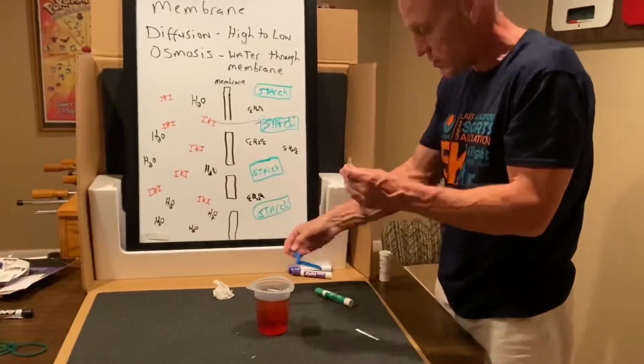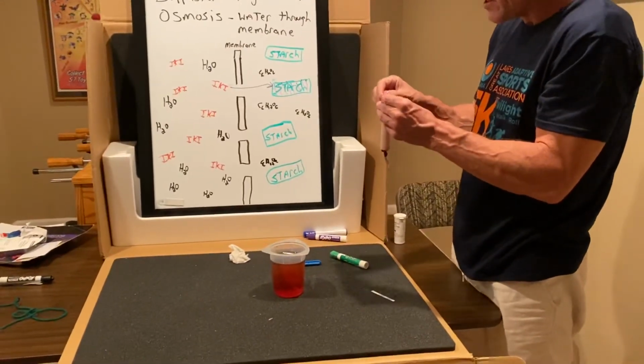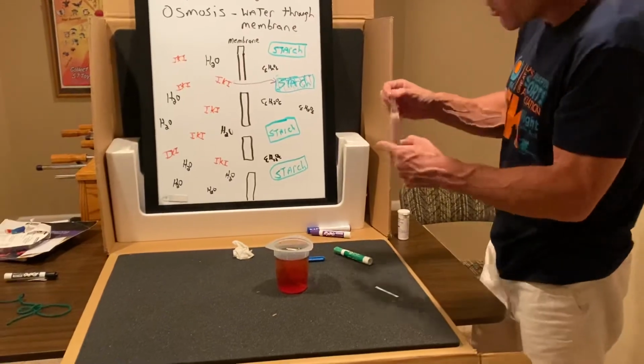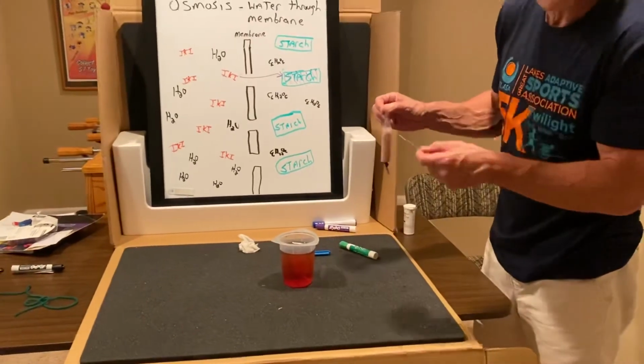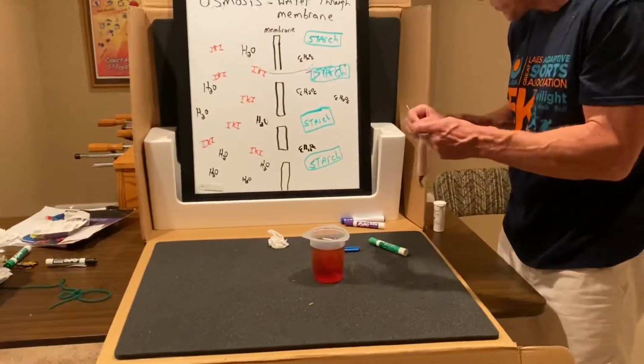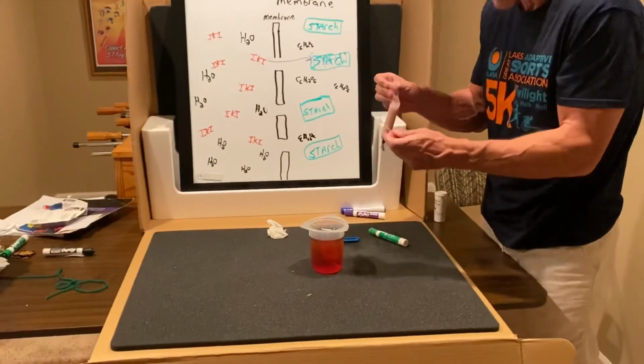Now, I got to open this down here, and I'm going to put the test strip in. And the question is, I didn't need to. Well, we know there's glucose in there. I put it in there, right? I meant to test the beaker. We didn't really need to open that. Well, shoot. Want me to do it? Nah, that's all right. I'll just do the beaker. Let's assume it's in there.